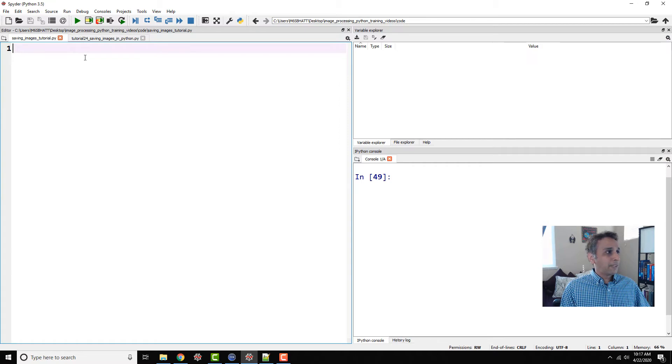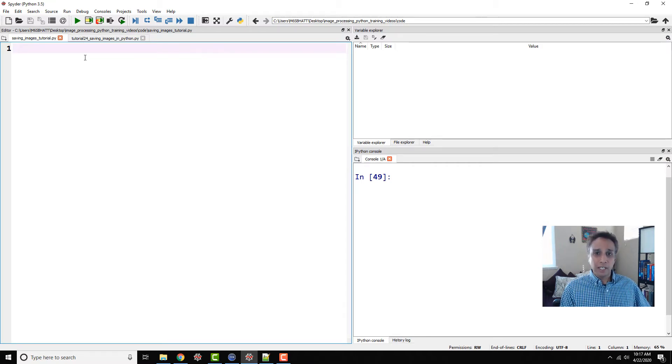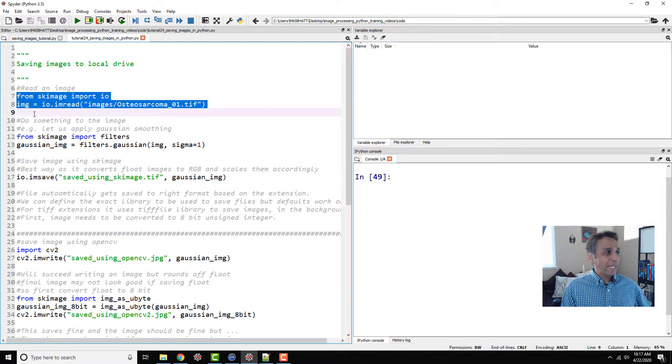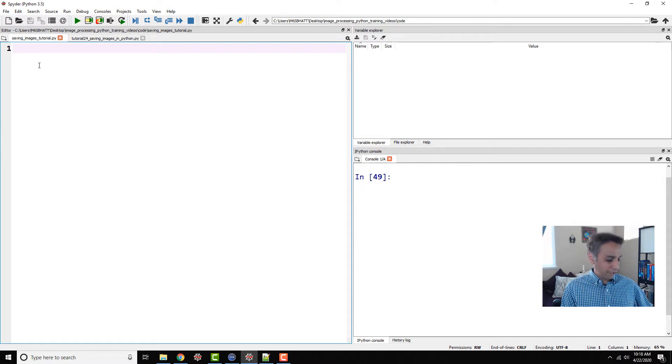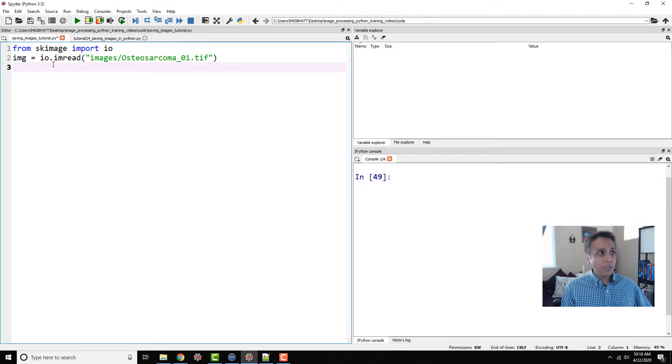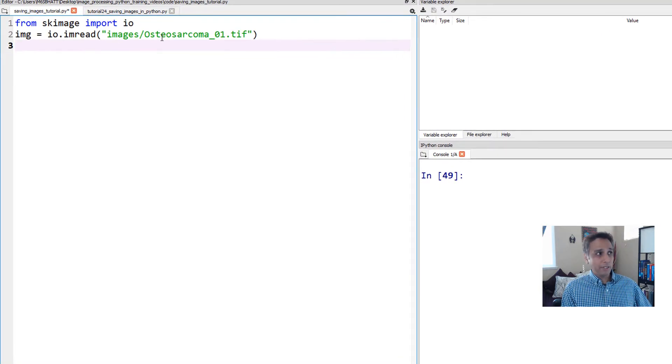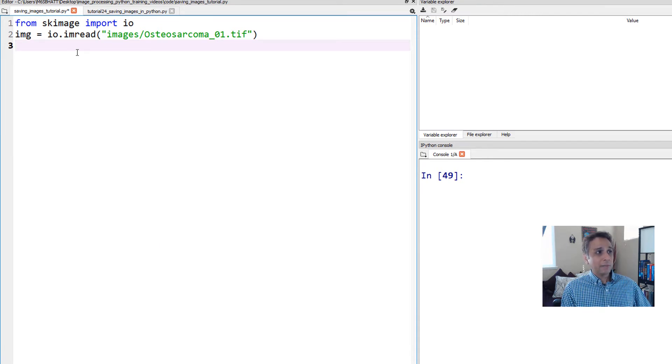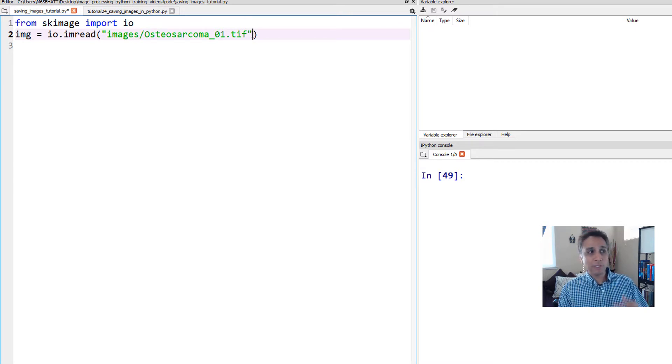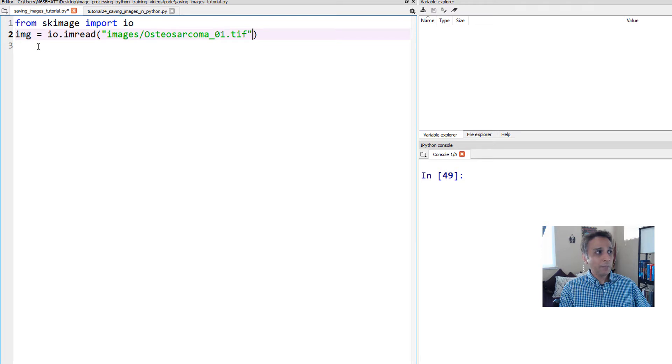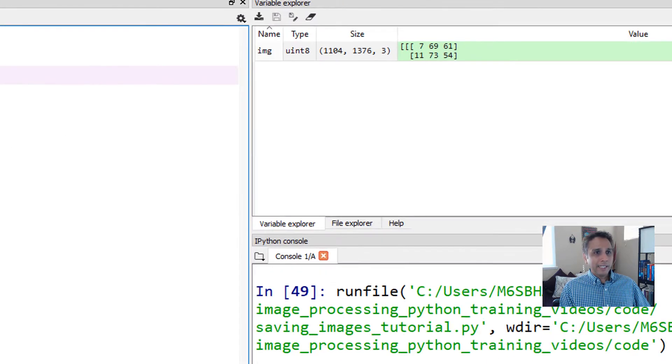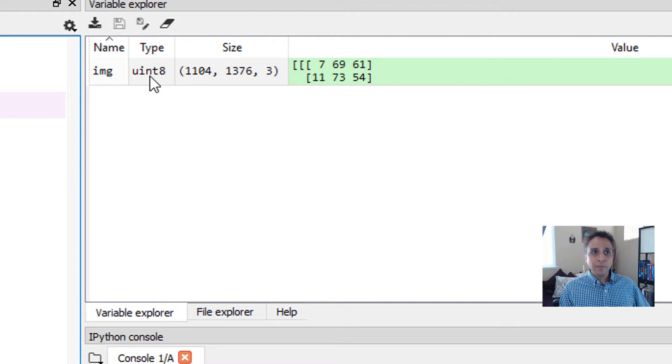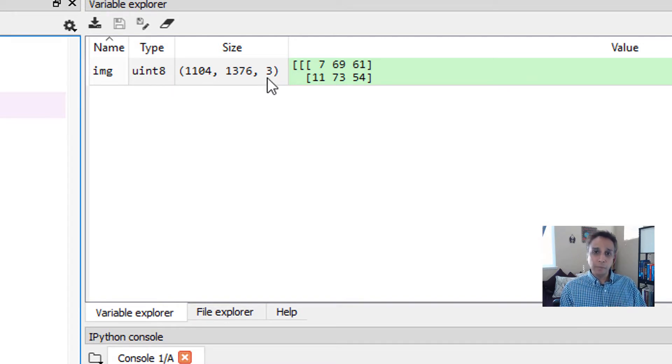As usual, I've pre-written the code so we save time. Let's start by reading an image. From scikit-image, I'm using io.imread to read this image without setting as_gray to true or false, which means it's read in as a NumPy array. It's unsigned integer 8 with dimensions 1104 by 1376 by 3, where the three stands for red, green, and blue.